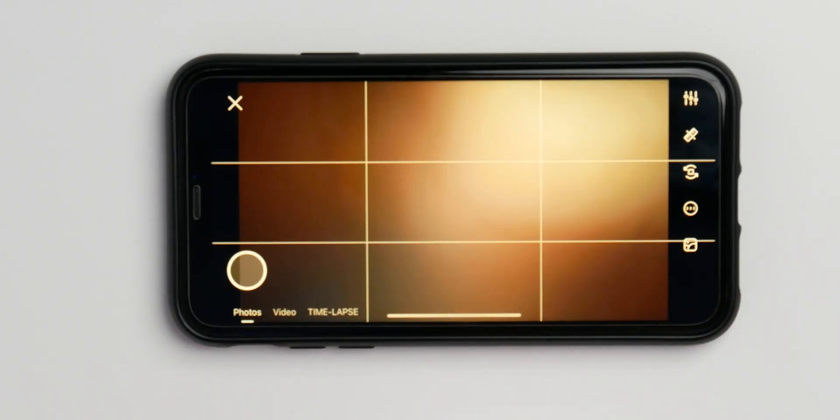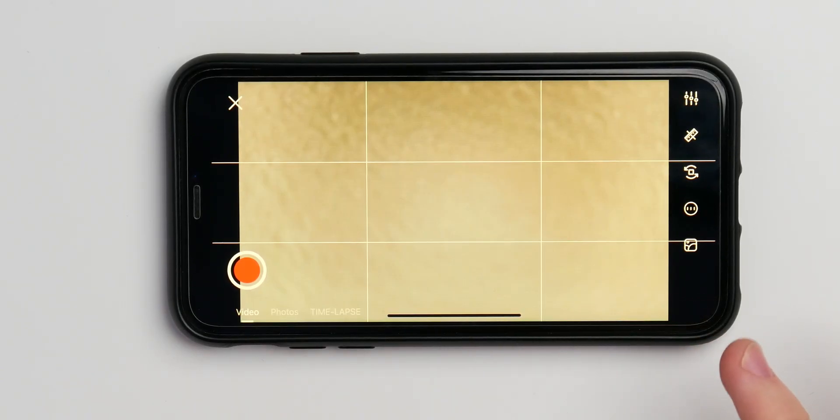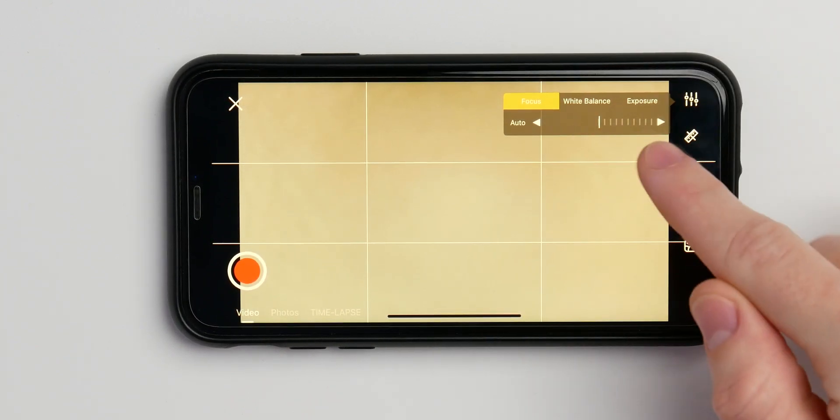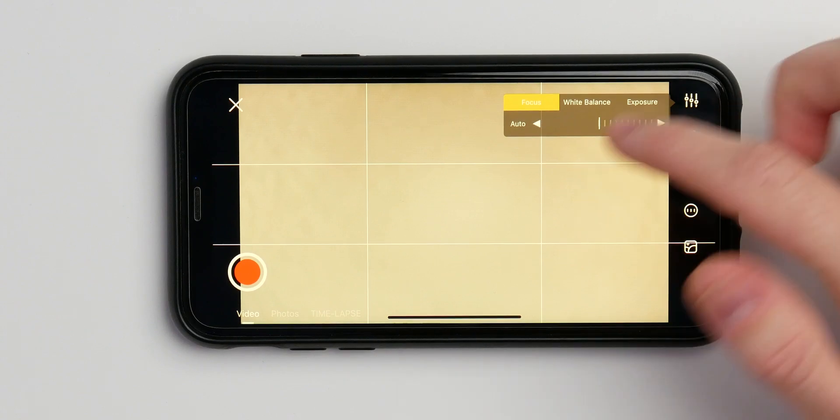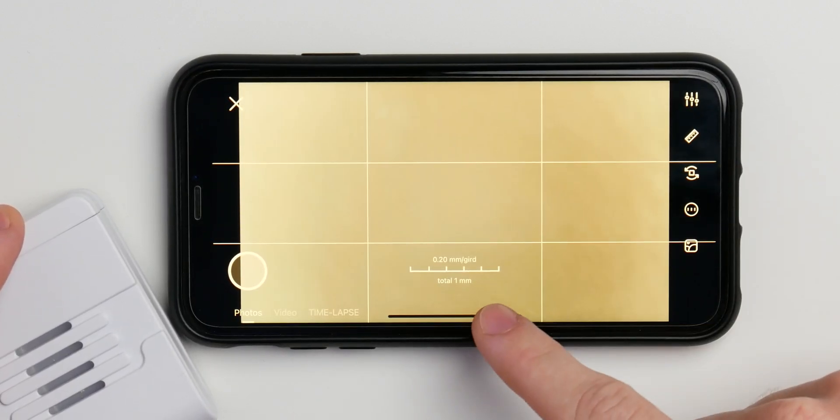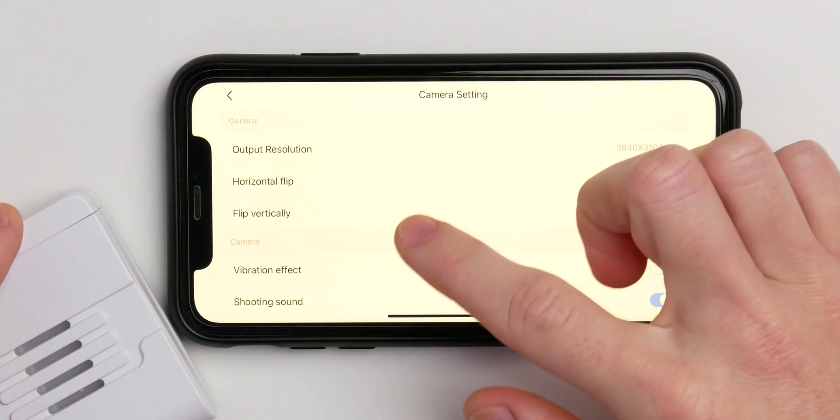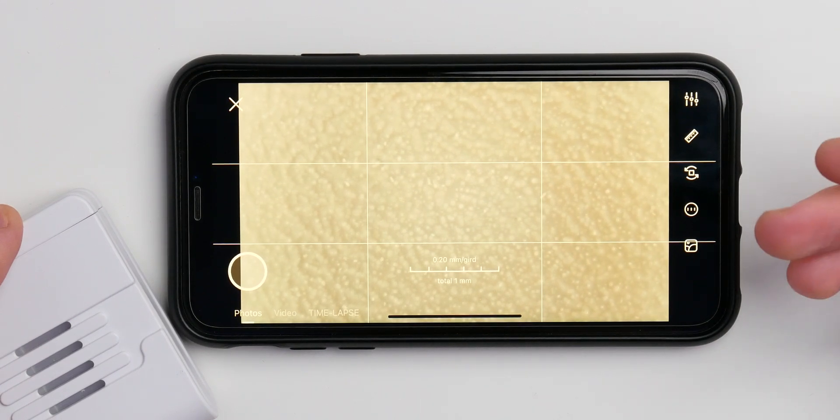The things you can do on the app is just super simple. As you can see here, you can switch between photos and videos. You can video record what you see on the microscope here. And you can also turn this around here so you're now seeing the table. Give it a short try. It always tries to adapt when it comes to exposure and focus. But you can also go up here and you can set the focus from automatic to manual as well as white balance and exposure. You can always set it for yourself or set it to automatic and set it and forget it. You also can have a little grid down here where you can see and switch to photos. So you now have here the scale. And you can also set the resolution. I set it to the maximum resolution as well as you can set some horizontal flip, vertical flip, shooting sound, reference line, watermark, all the basics you probably want to have from a microscope like this.